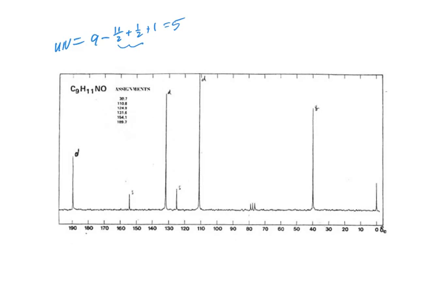Okay, so what do you see? So we probably have a benzene ring as well. You know, our benzene peaks are much more spread out here. Anything else that you can see? The carbonyl. What about it? 190. Yeah, 190. What else about it? So there's a hydrogen on it. Right, it has to be an aldehyde because it's a doublet. Right? So this has to be an aldehyde. And being at 190 means what?